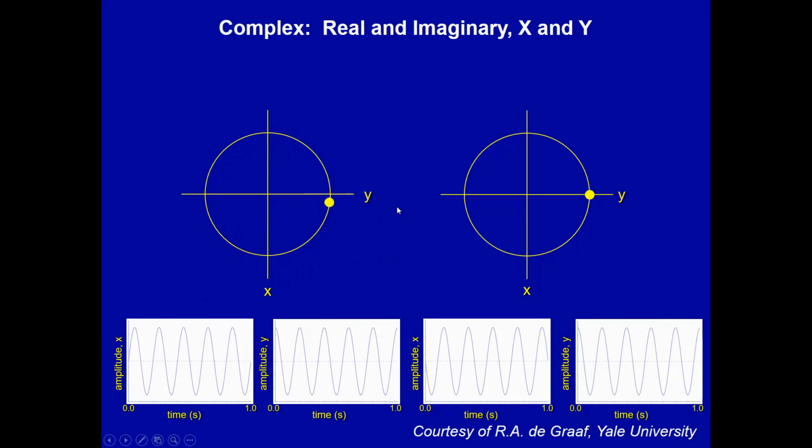If we go to the other side, we have now a counterclockwise rotation. Look at this graph. We start with 0 in x and 1 in y, just the same as what's on the left. But now we go to a negative value on x. Yes, it's on top of the graph, but imagine positive goes toward where the letter is located on the axis. So we have a negative x value at the same time we hit a 0 crossing on y.